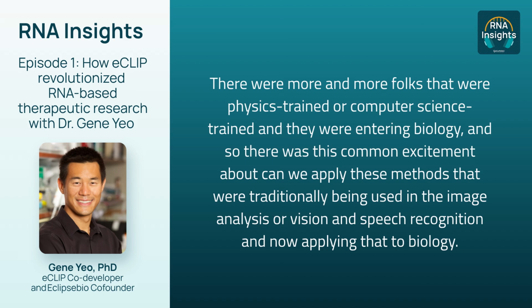In the first step, cross-linking, researchers expose RNA to ultraviolet light, which pauses all protein interactions on the RNA and leaves the RNA as a snapshot of the interactions that were occurring at the moment the RNA was exposed. Usually, researchers then fragment the cross-linked RNA to perform the second main step, immunoprecipitation.